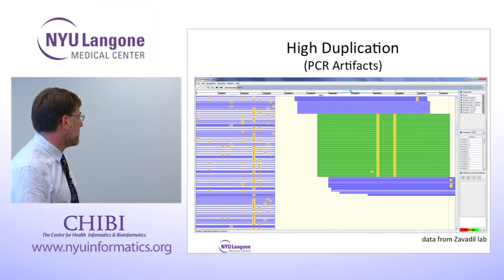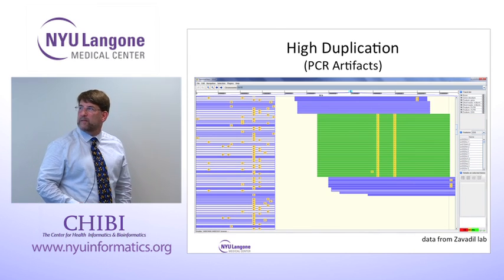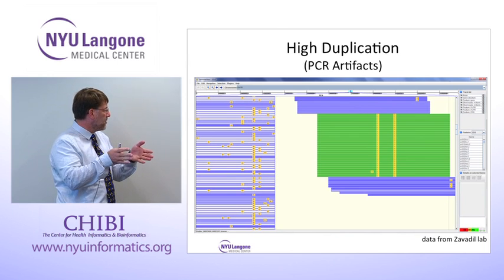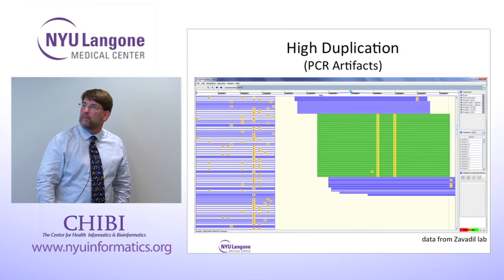By the way, this you get after filtering out how many mismatches? 2 mismatches, a maximum of 2. So if you have 2 mismatches in the 32 base window.